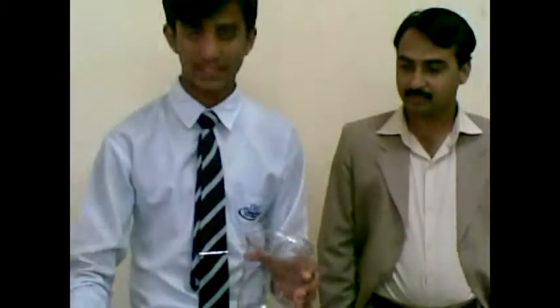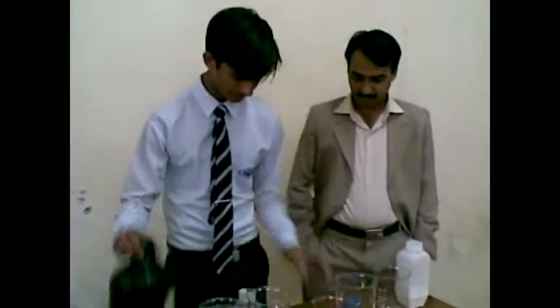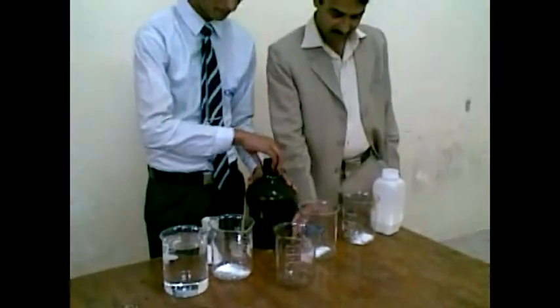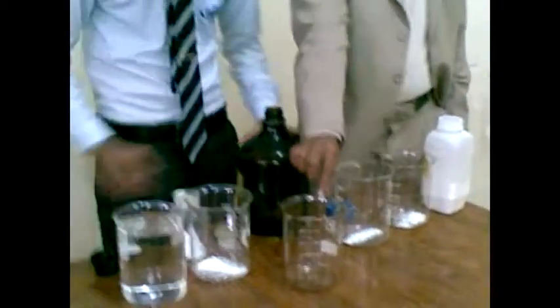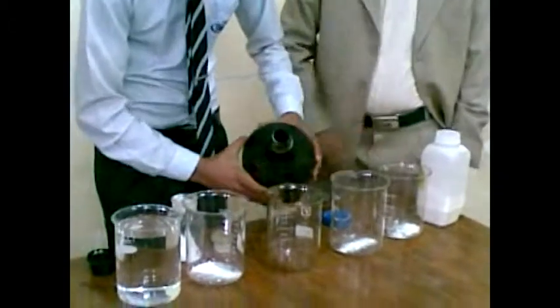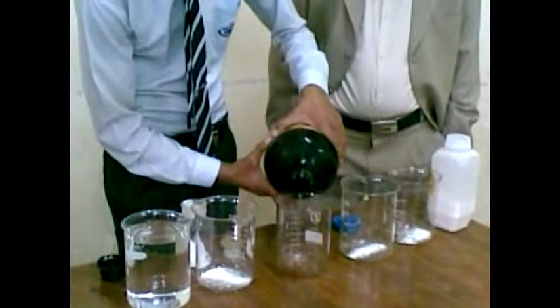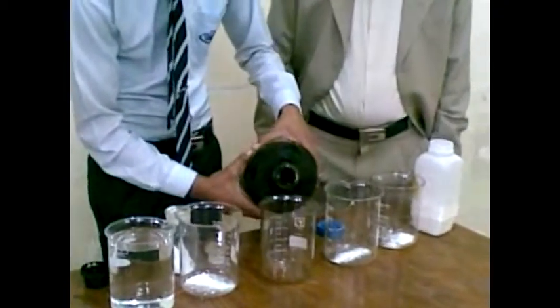Now this beaker is empty, now I fill it with the acetic acid. We use the acetic acid also in a little amount because it is dangerous.